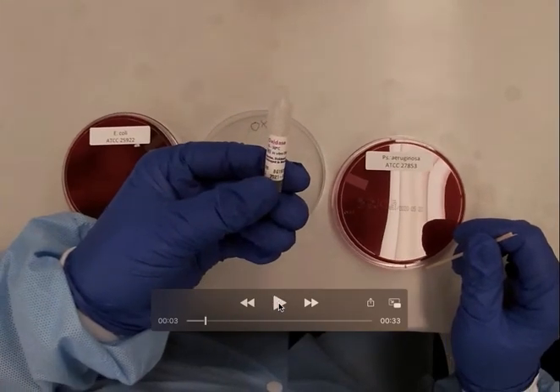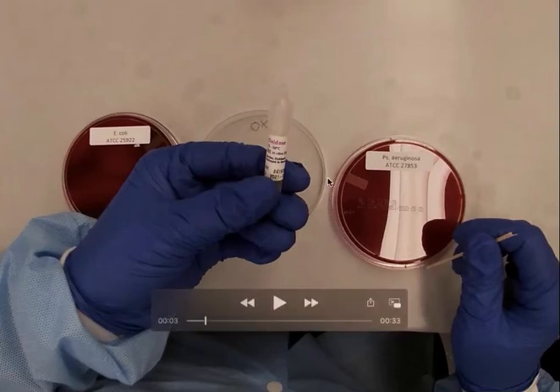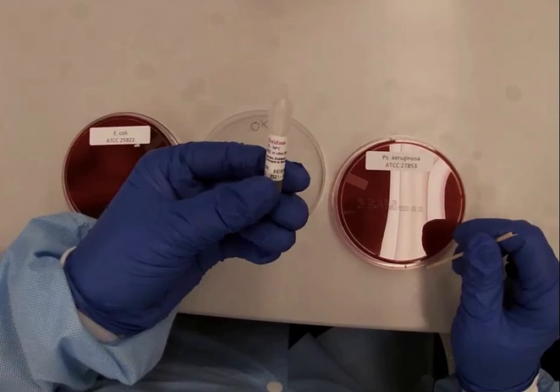E. coli is oxidase negative and Pseudomonas aeruginosa is oxidase positive. When you are doing quality control for the oxidase test, these two organisms will be your QC organisms. Let me know if you have any questions, and have a great day!